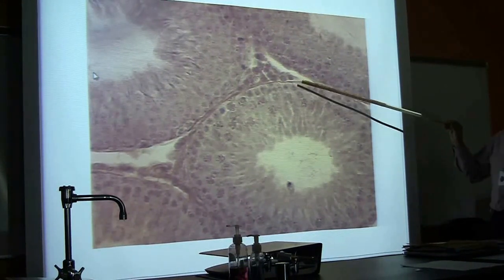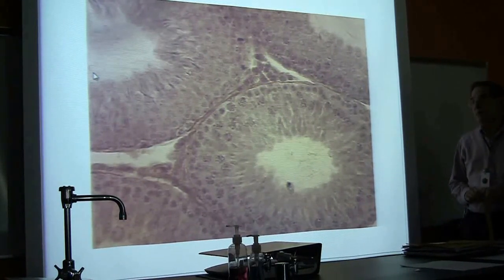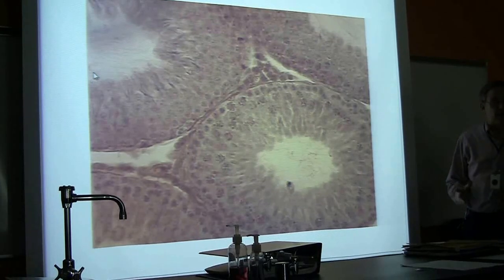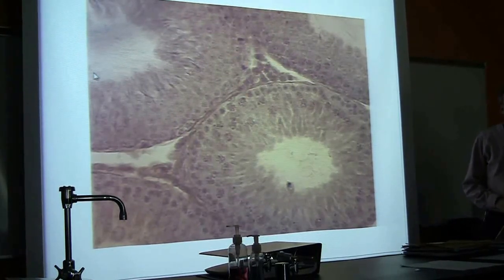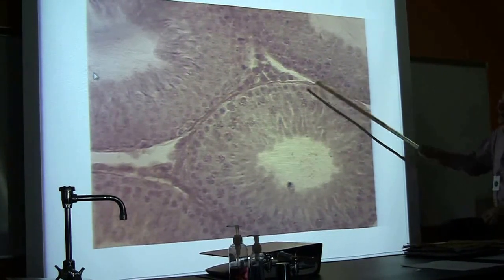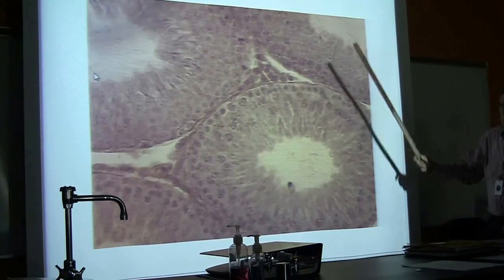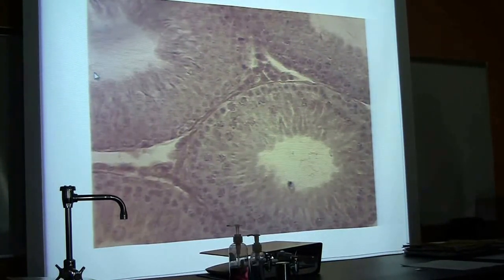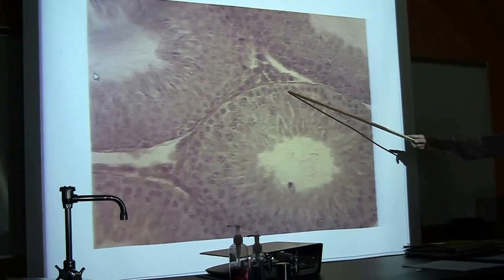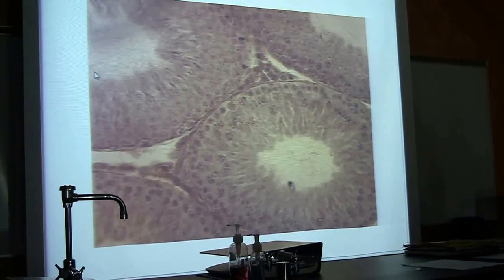These cells are not directly involved in spermatogenesis, but rather they produce nutrients to keep the sperm viable. The sperm are living cells, like any cell in the body, so they have to be provided with nutrients. Again, these have an oval nucleus, you can see right here and right here is the prominent nucleolus. These are the nuclei of the sustentacular or Sertoli cells. See one right here and right here as well. They tend to be more to the outside of the wall of the seminiferous tubule.